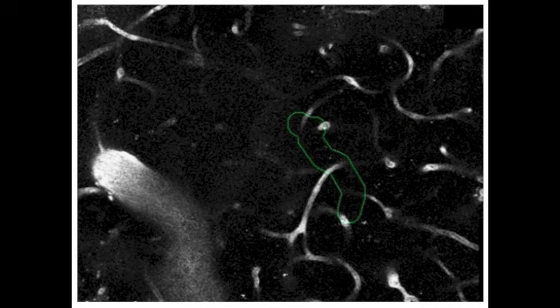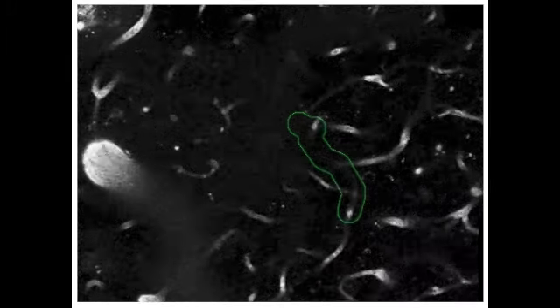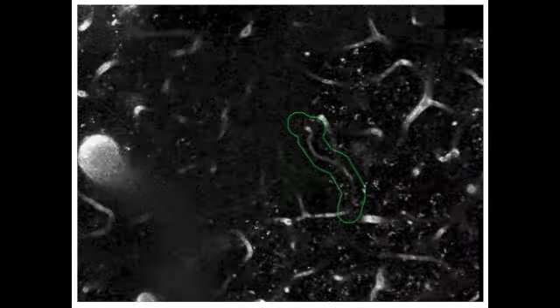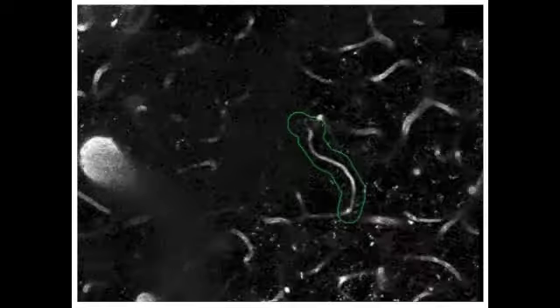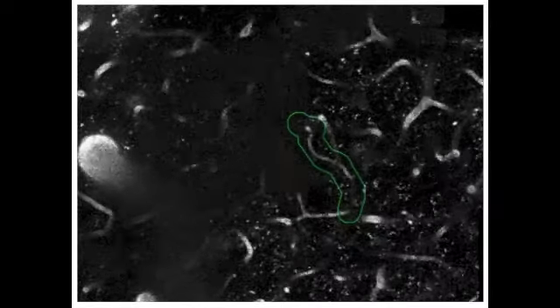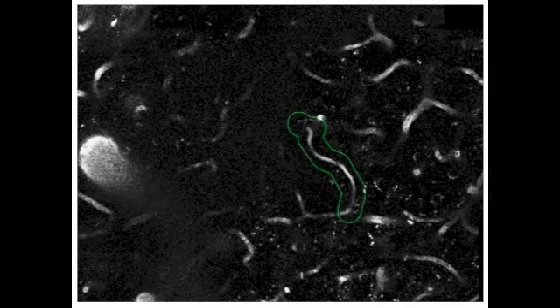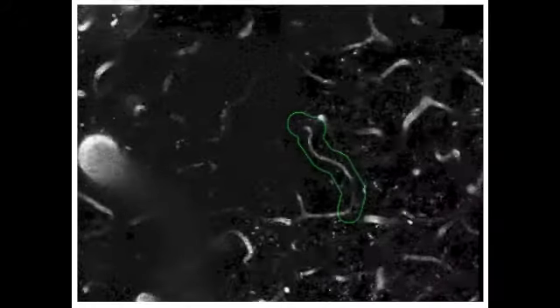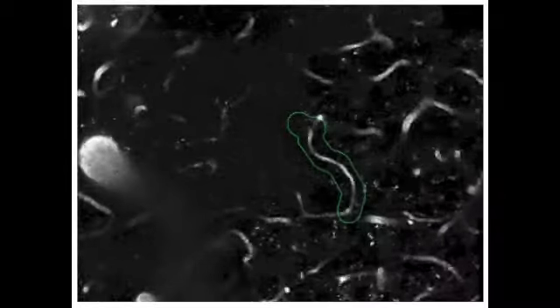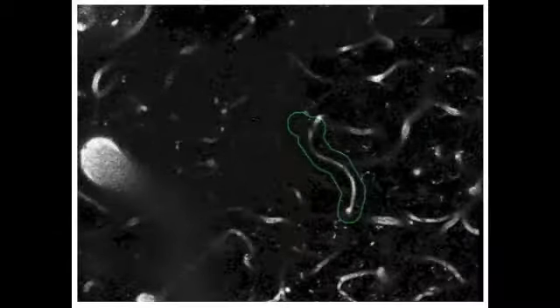This is a nice elongated outline, which tends to mean that the vessel is oriented horizontally. When this happens, we typically see the entire vessel all at once, which makes it easier to annotate. Now we are trying to find a stall — that would be a dark spot that isn't moving in the vessel. If we stop scrolling back and forth, we can create the appearance of a stall, but those are just red blood cells that aren't moving because we're not moving the slider. For it to be a stall, those black spots have to stay there even when you're moving the slider. In this case, the black spots are moving through the vessel, so we call this flowing.